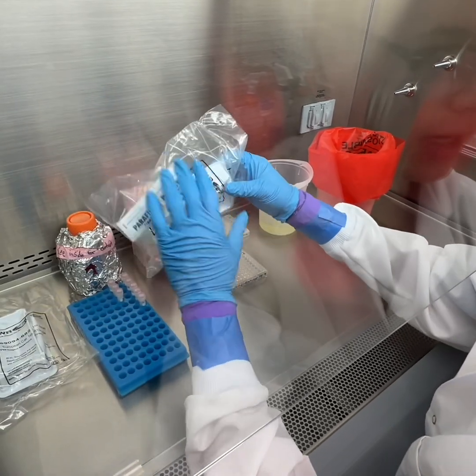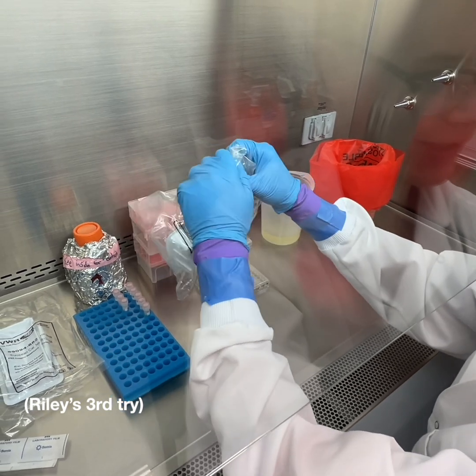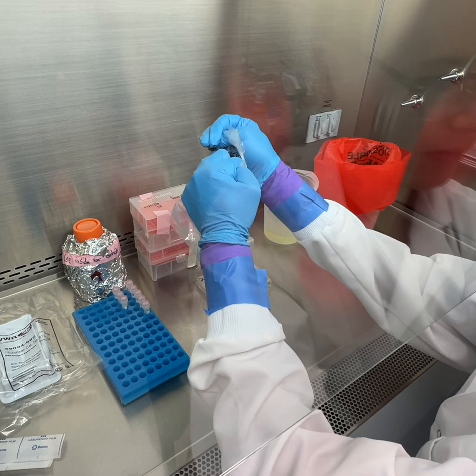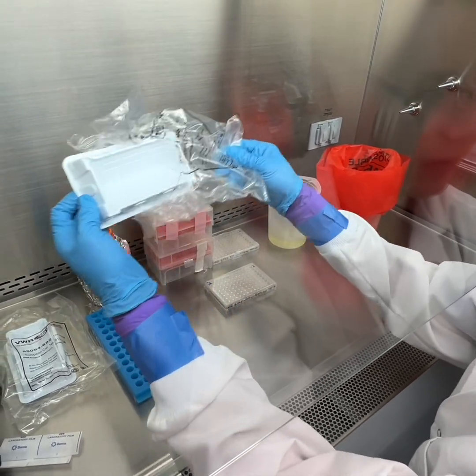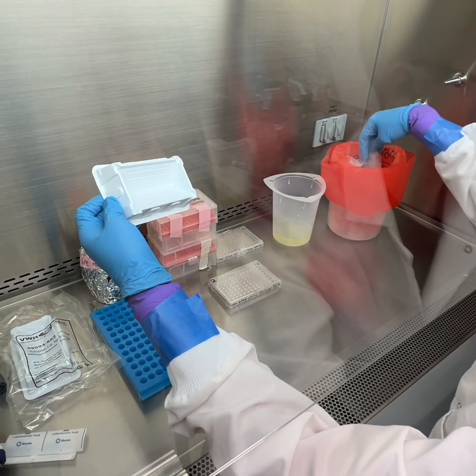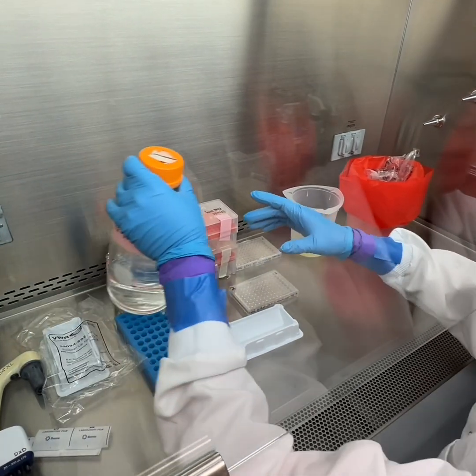First things first, I'm going to open this up and put some PBS in here. Okay, we have our 1X PBS.